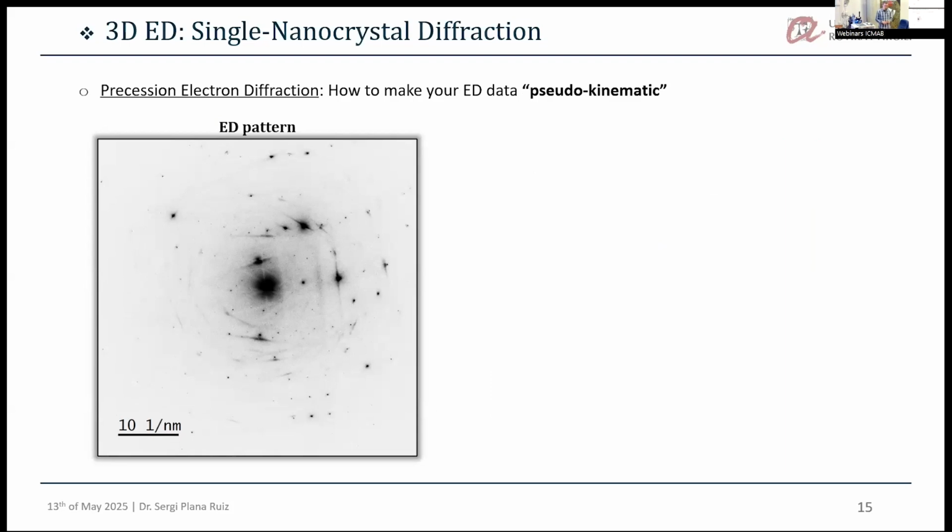Okay, so you are happy with this. You go to the microscope, and then you get an ugly diffraction pattern like this one. And then you just don't want to work with electron diffraction anymore. So yeah, you have these situations in some cases in which we have a lot of different things produced by multiple scattering once again, but it's not included in the formalism that I have shown you. And this sometimes is painful to work with.